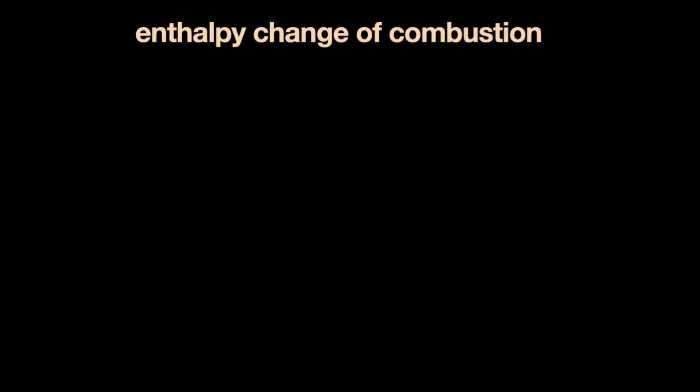So now let's look at how we can measure enthalpy change of combustion reactions in the lab. Now, combustion occurs all around us. We burn fuels, we burn methane gas, we can burn alcohols, and you can even burn metals with oxides. Because what is combustion? It's basically when you burn 1 mole of something in excess oxygen.